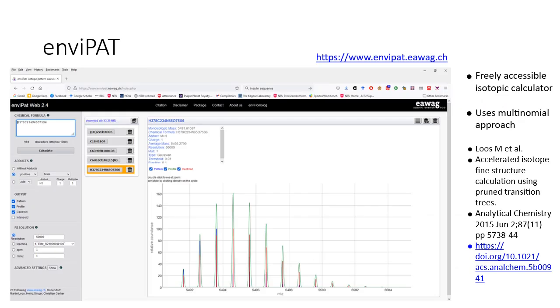But however they're calculated, all of the potential ways of calculating isotopic distributions with realistic peak shapes and resolutions are far too complex to be realistically attempted by hand, so they're always undertaken by software. Many mass spectrometry packages provided with instruments will include these types of calculators, but there are also some excellent ones available for free on the internet.